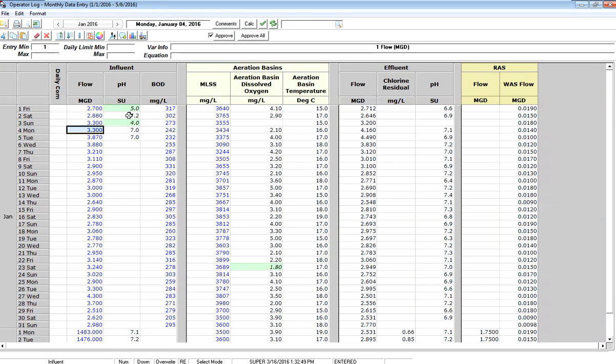This is all there is to monthly data entry, the basics. And other videos will take you through some advanced troubleshooting using monthly data entry. Thank you.